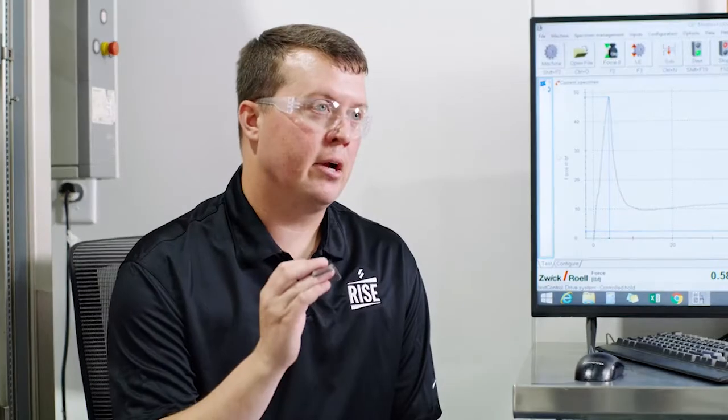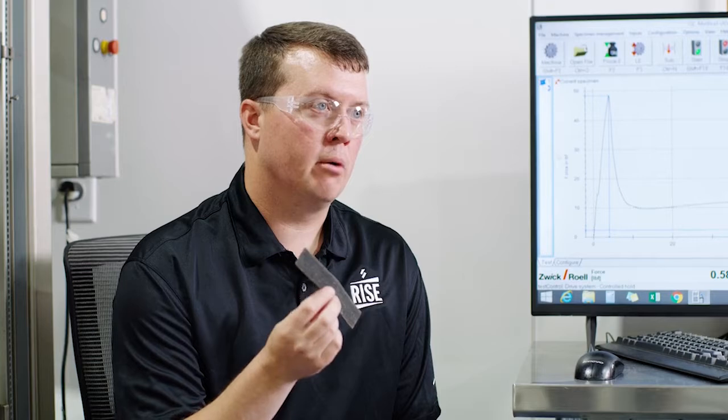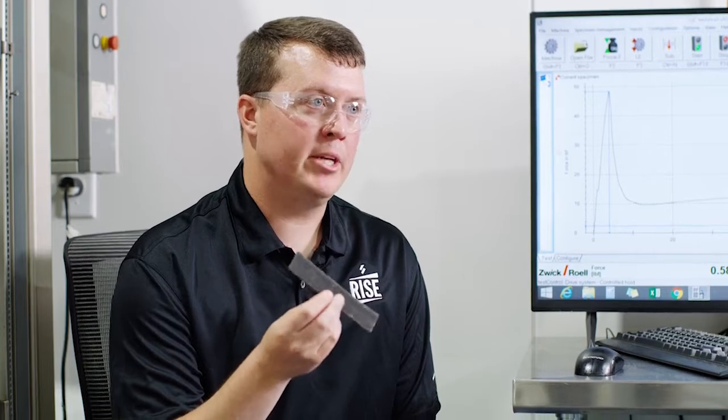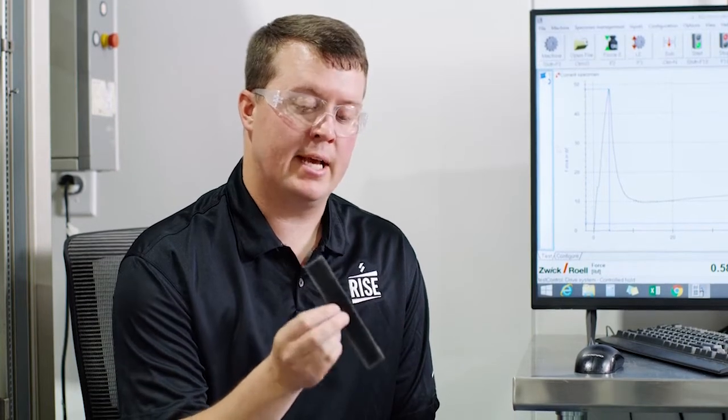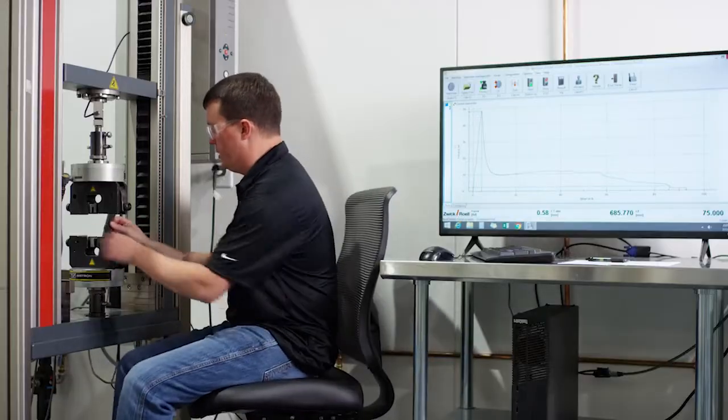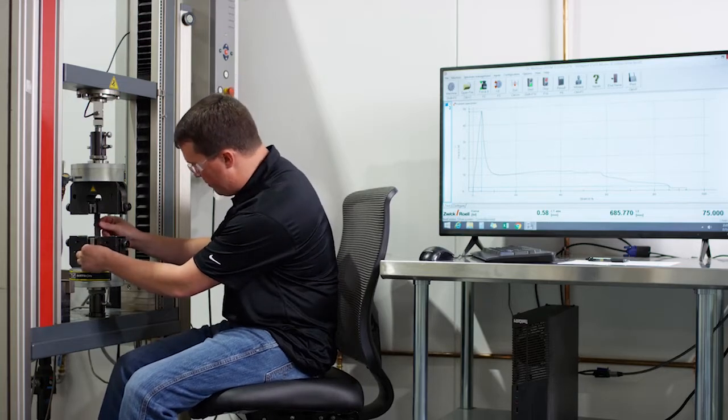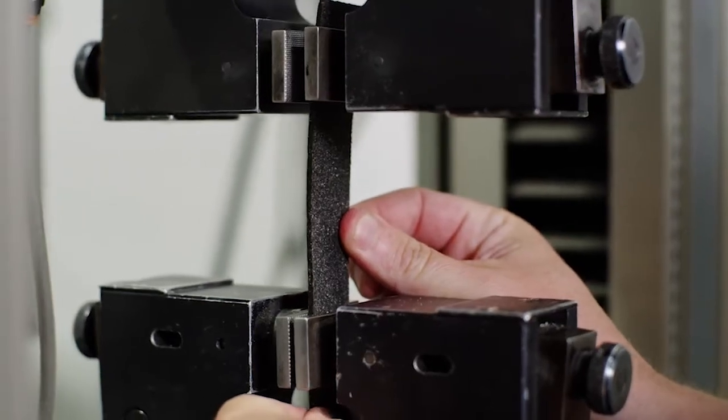I have a sample of Peridene 20 TG, it's one of our modified bitumen base sheets. This has a fiberglass reinforcement in it. So I'm going to load the sample into the unit here, two sets of jaws.